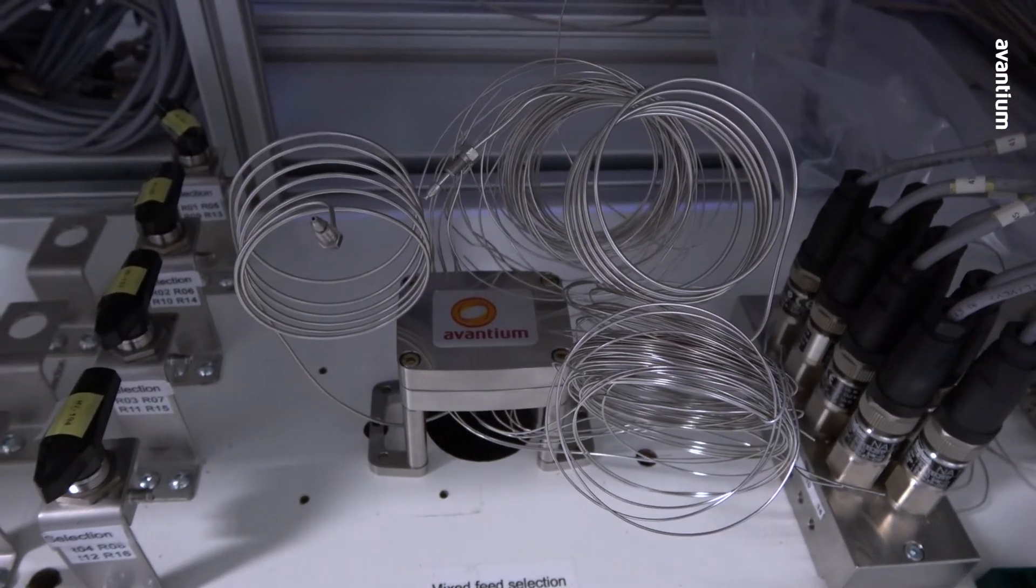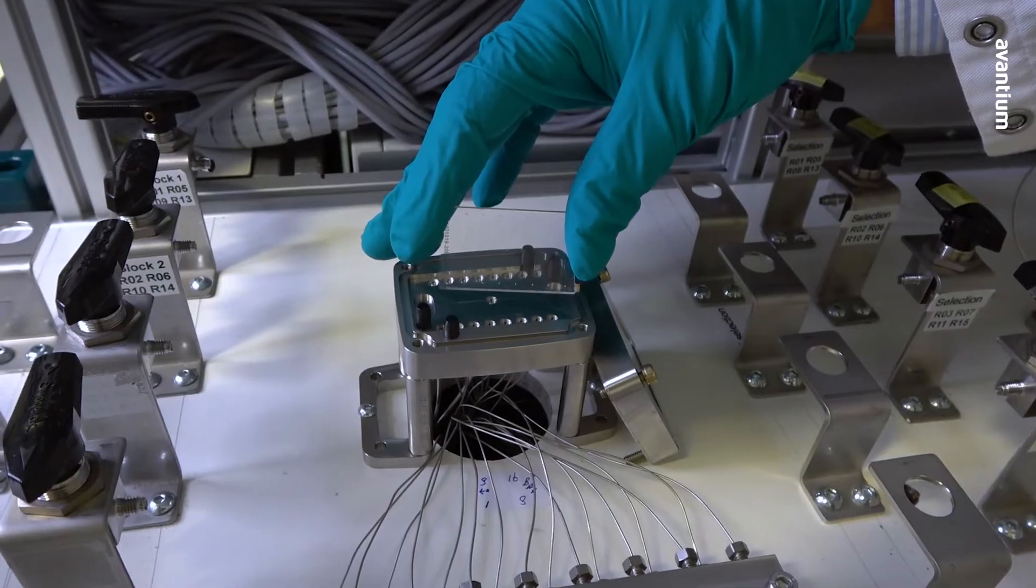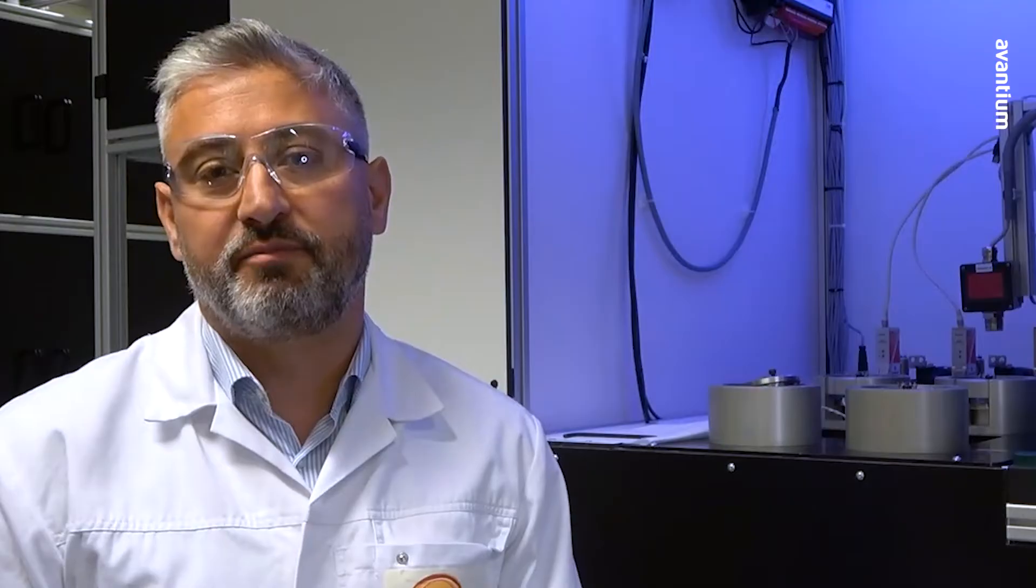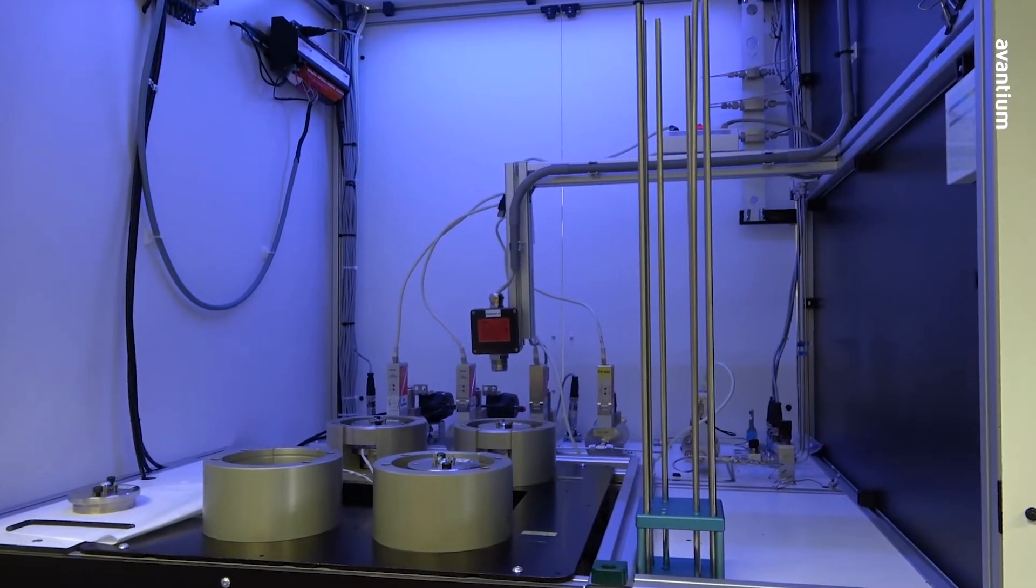This ITURPU testing unit was developed using our Flores technology. The way we distribute the gases, we make use of our microfluidic glass chips. Then of course it has a GC. All the product is kept in the gas phase and the complete product is analyzed on the GC online.